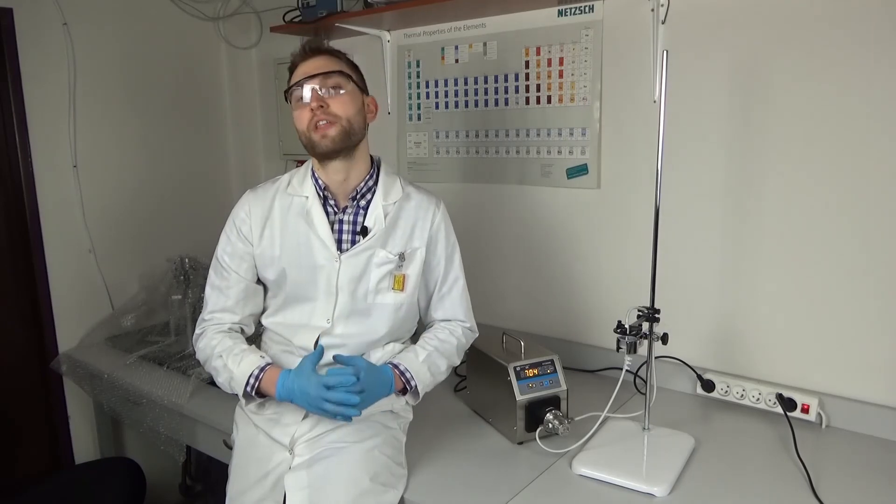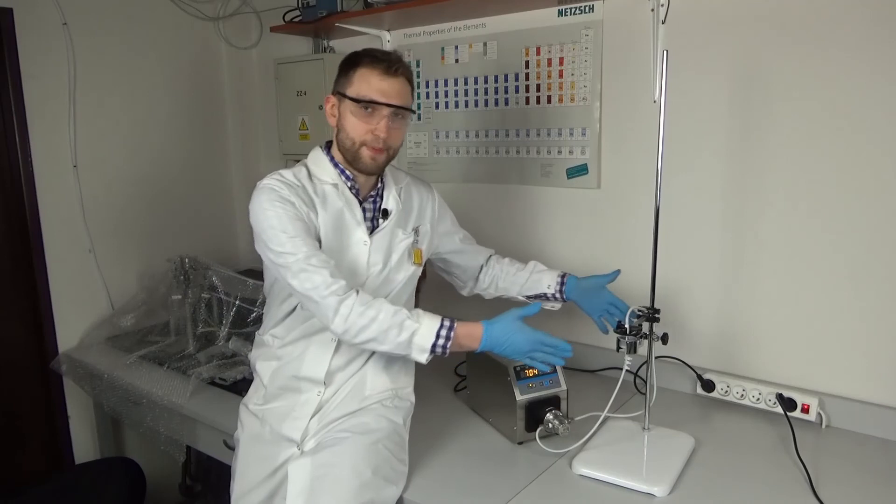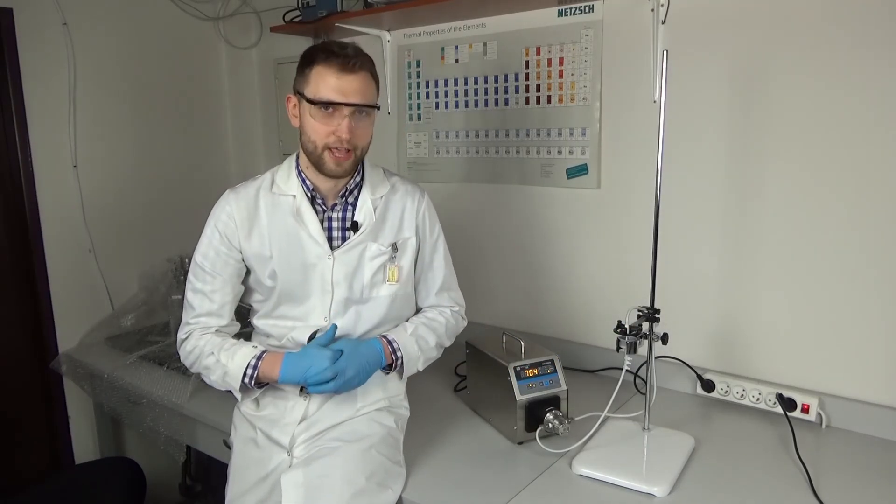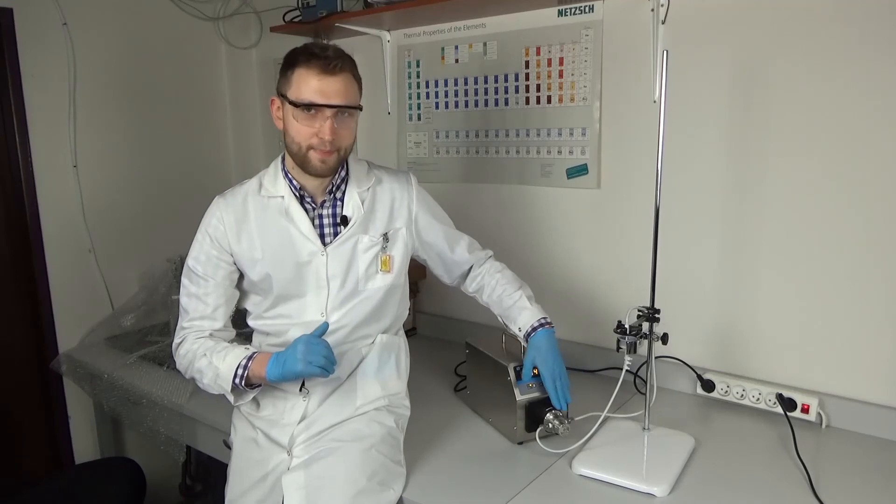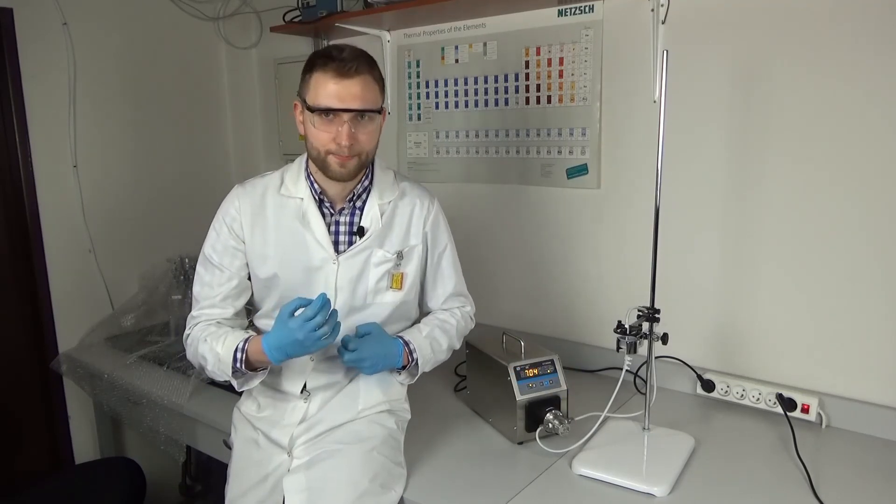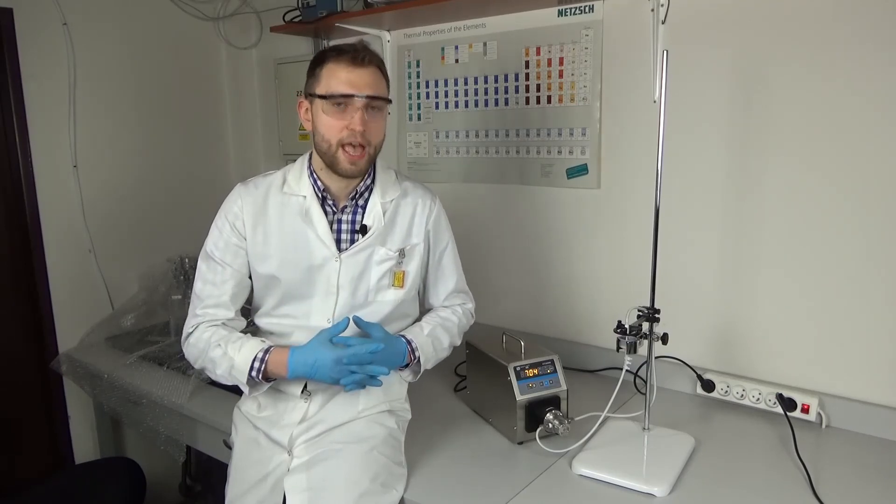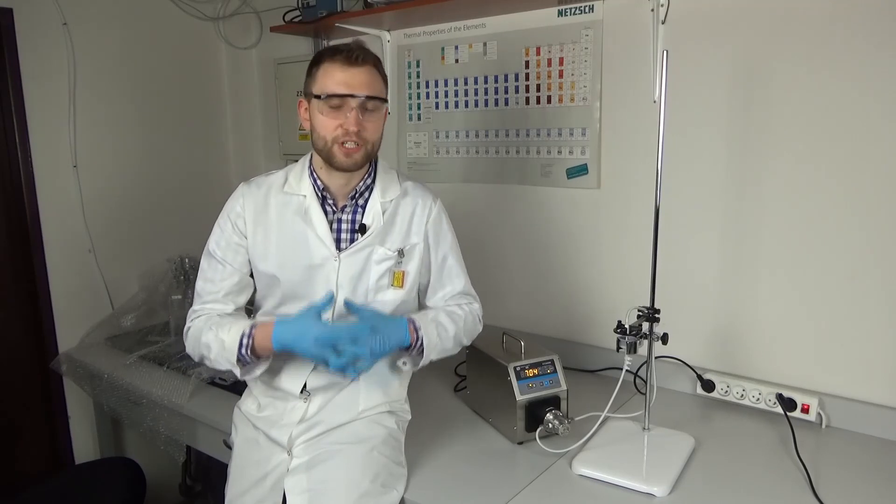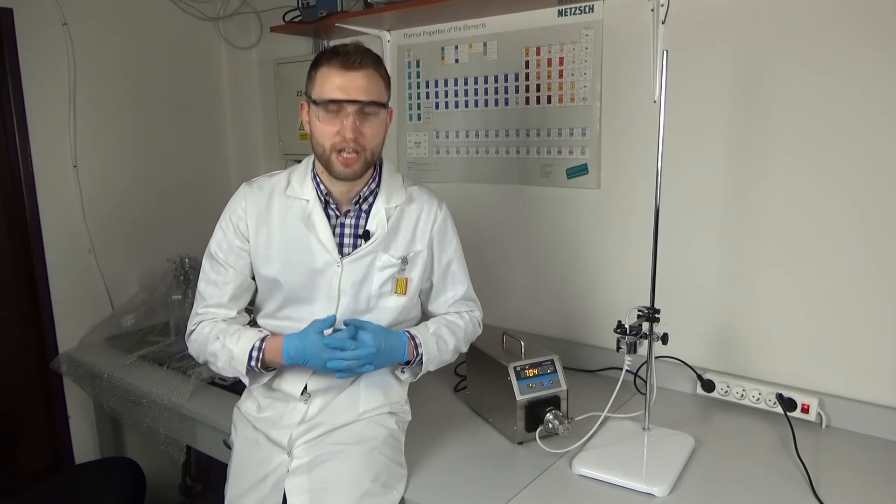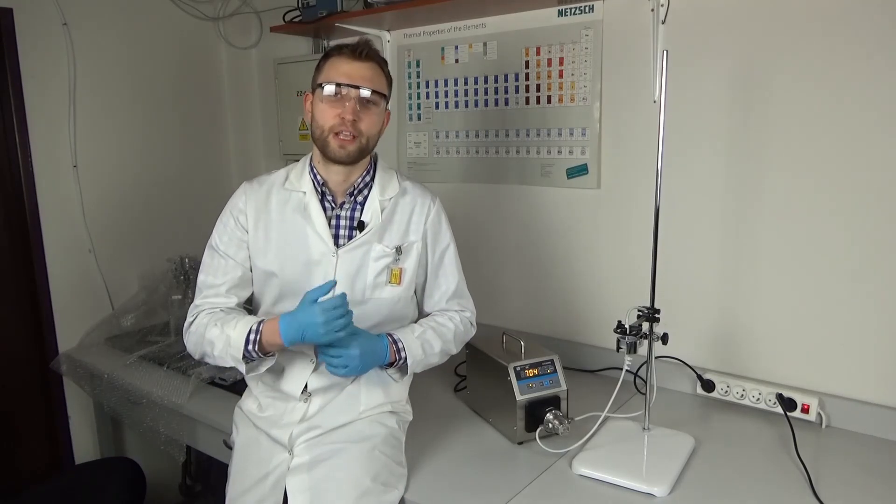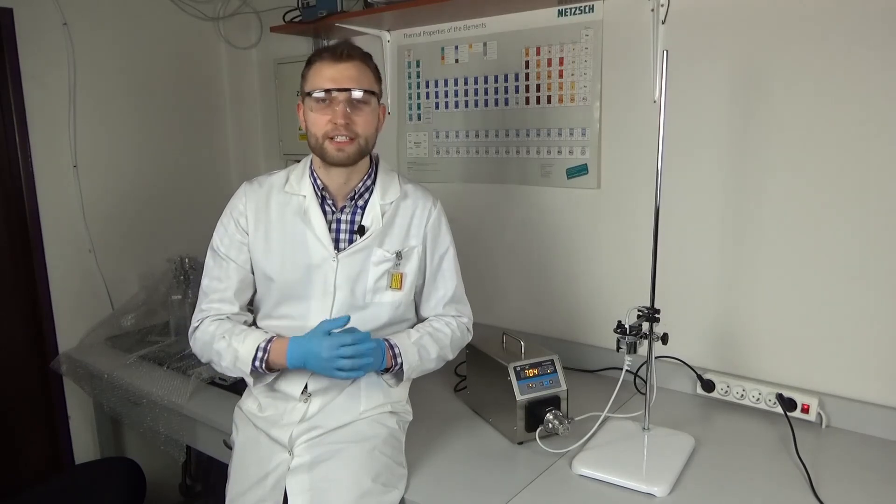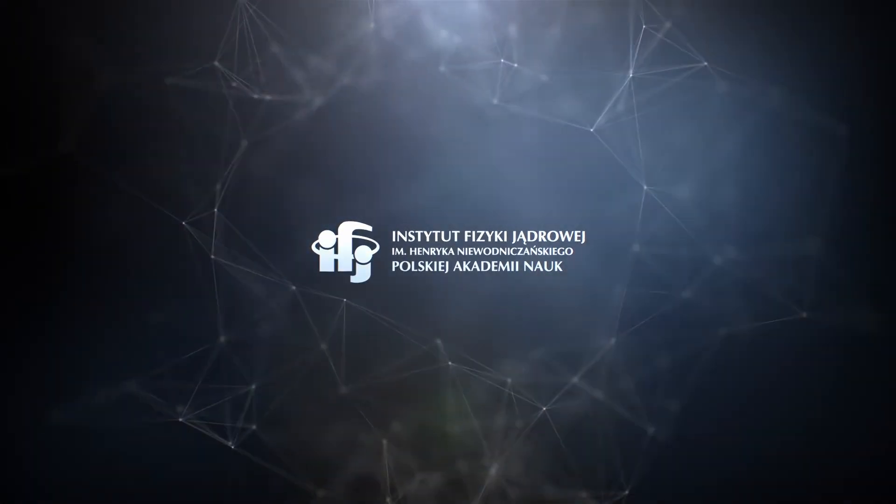The advantage of the system is its simple operation and the ability to probe liquid samples without any prior processing. The entire setup takes up a relatively small area, and its individual components like jet nozzle, laboratory tubes, and head pump are easy to assemble and easy to replace, which allows us to transport the system and use it in other places, especially in facilities with more advanced X-ray sources like synchrotrons and X-ray free electron lasers. So this is how we prepare liquid samples for laboratory experiments. Thank you for your kind attention. Take care.